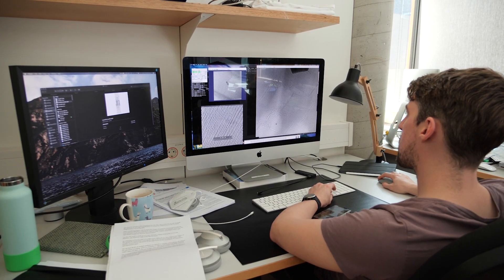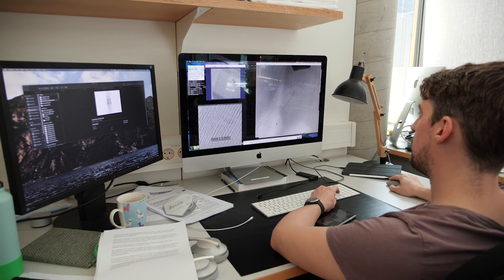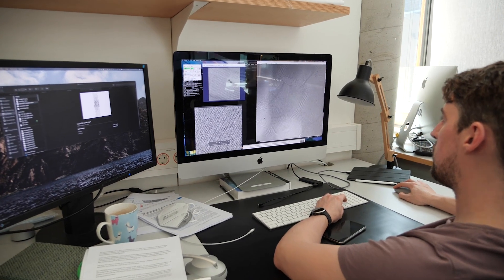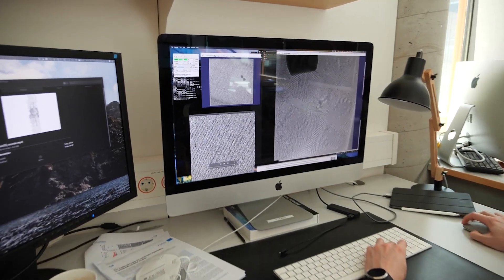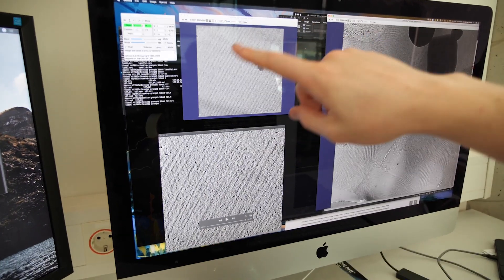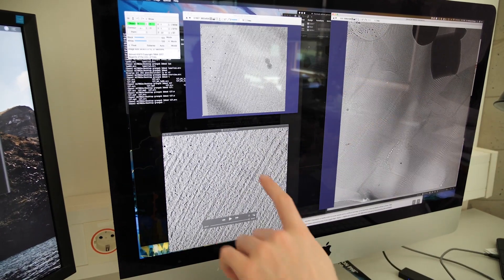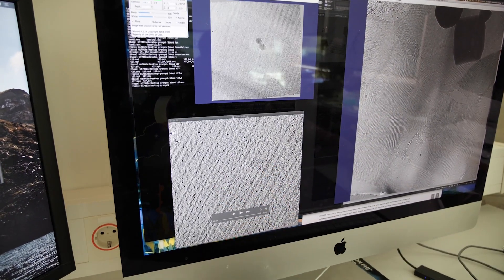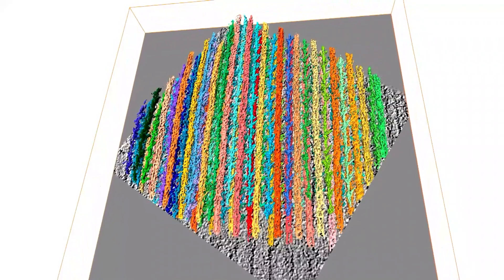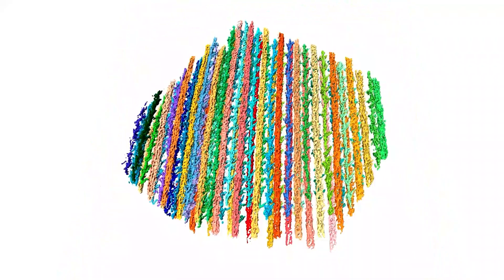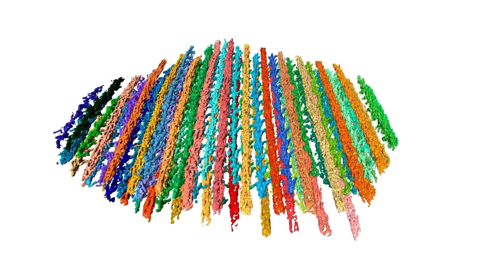By collecting a series of images at a range of tilt angles, we can then compute the volume of the sample for visualization, which is called a tomogram, and curate the macromolecules that are within. This enables us then to build up a 3D picture of the organization of the components of a sarcomere and characterize them.